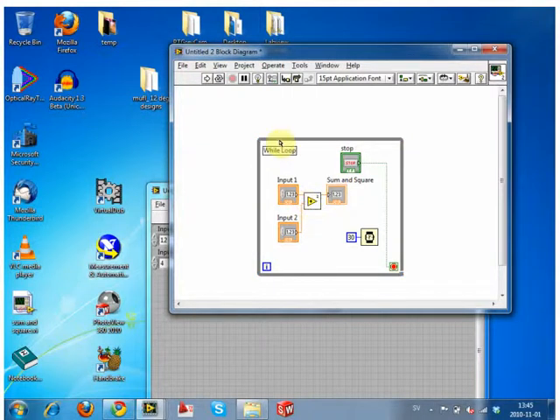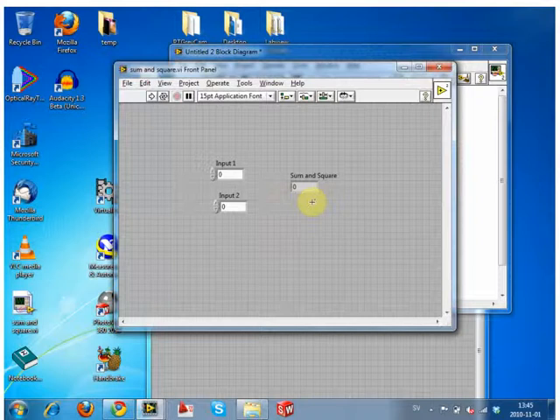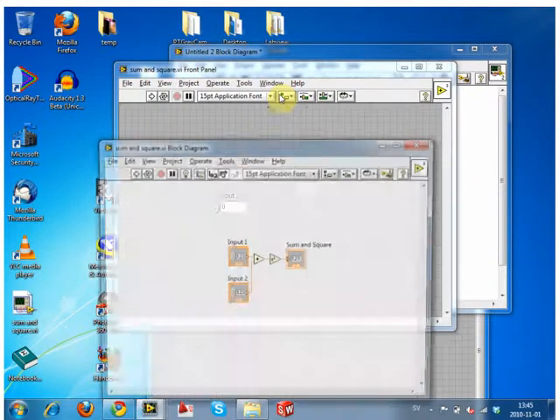The connector that we made, so right now, if you're in this block diagram, you don't have to keep opening up these as separate programs to actually see what you put inside it. If you just double click on it, it will open it up as a new window. And then just go to Window, Show Block Diagram, and then you can see what your sub-program is.